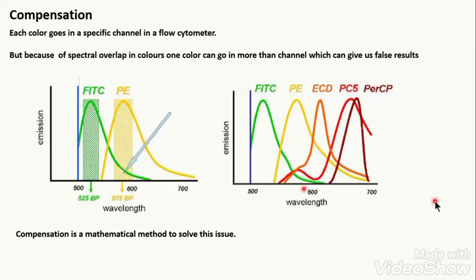So generally when I explain flow cytometry, people come with this question also, kitne ka aata hai flow cytometry? How much money do you need to buy a flow cytometer? That depends upon what flow cytometer you are buying. If you are buying a 2-laser, then it costs you around 50 lakhs. And if you are buying a 3-laser, then around 90 lakhs to 1 crore, and more than that 2 crore, 2.5 crore. So depending upon what your application is, as well as how much you can afford.